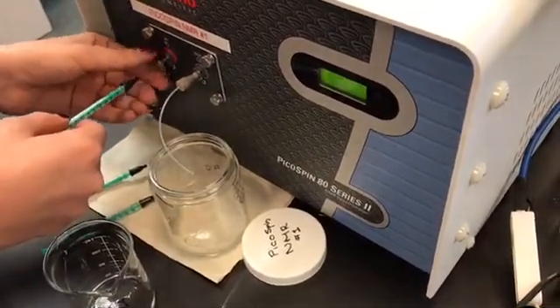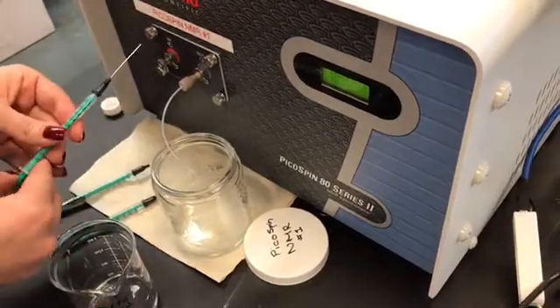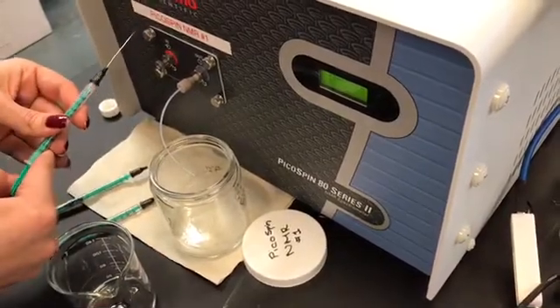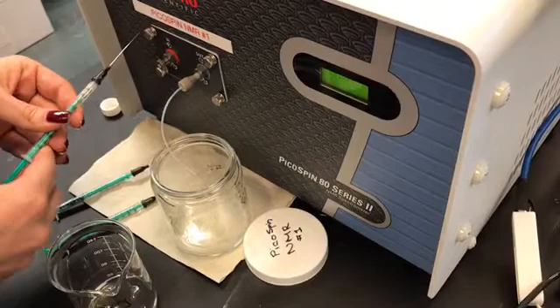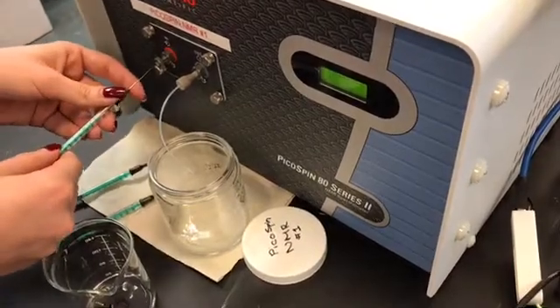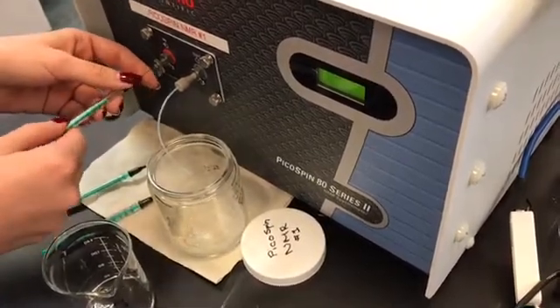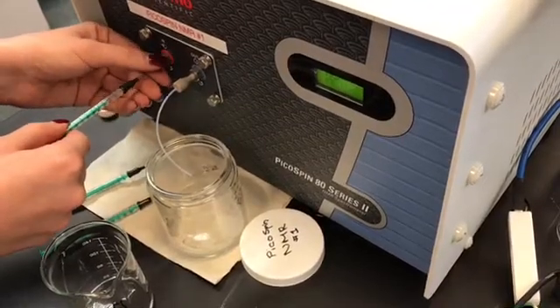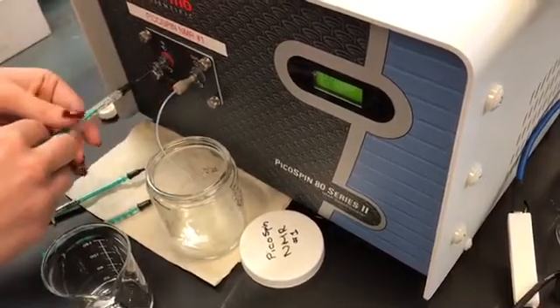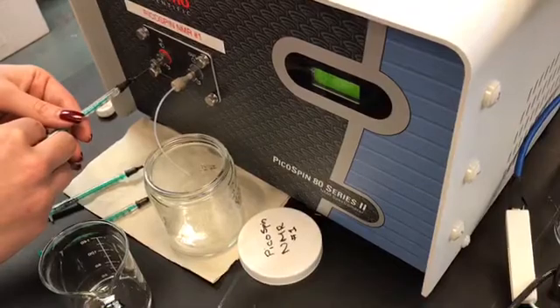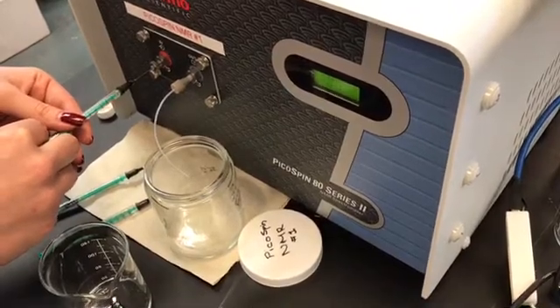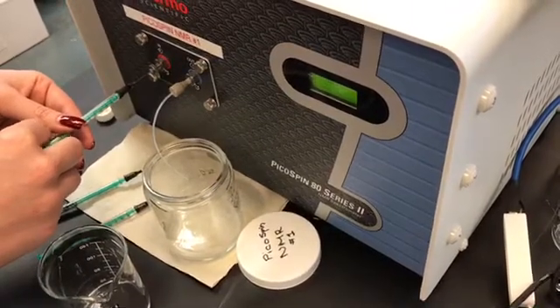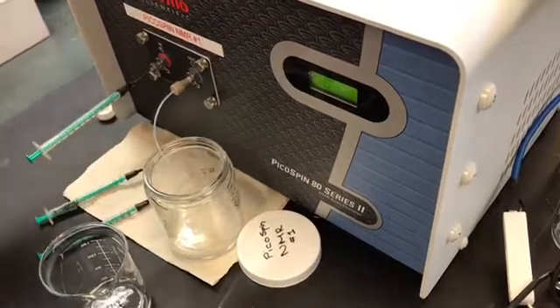We're going to loosen the screw and repeat this one more time. So we're going to withdraw air, insert it until it stops, tighten the screw, and once again inject the air, and we're going to leave the air syringe in the inlet port.